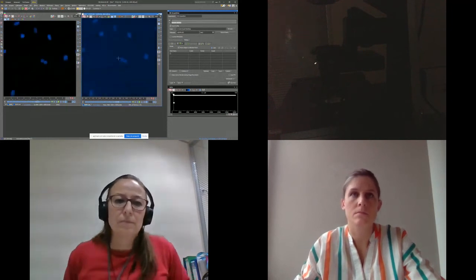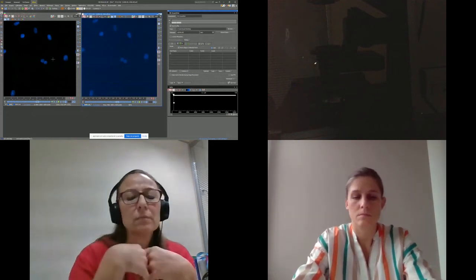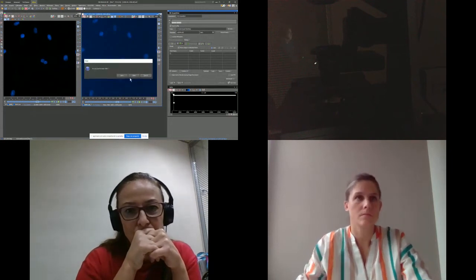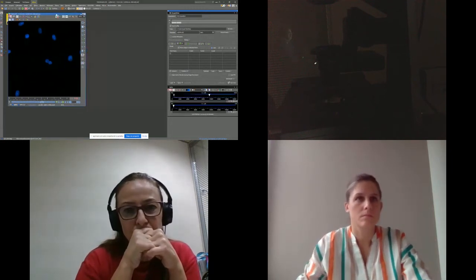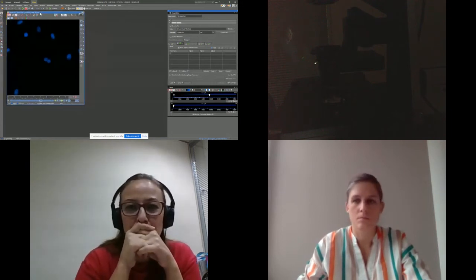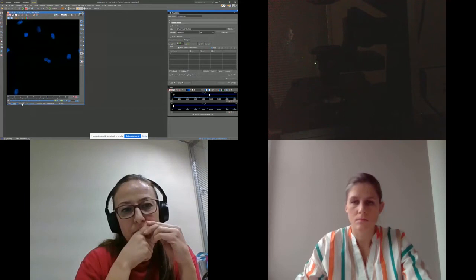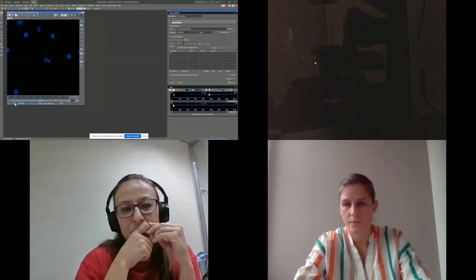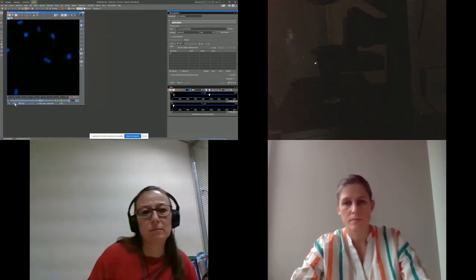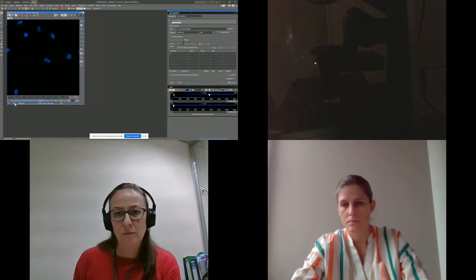So the challenge will be to transform this kind of image into an image similar to this one by using artificial intelligence, what we call enhanced AI. What I did this morning, very quickly, I'll show you so that you can see that it is really easy to use the artificial intelligence attachment. Here we have an ND file, the files that we get with our software. I simply have to go into the Explorer, create a new analysis Explorer, and say train.